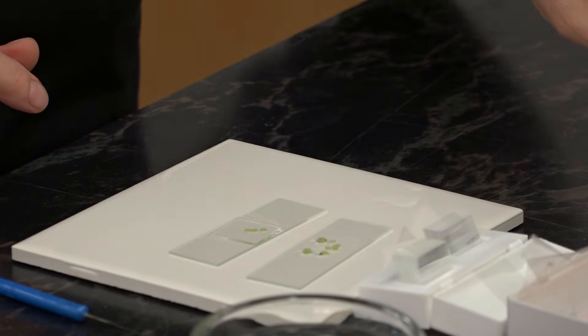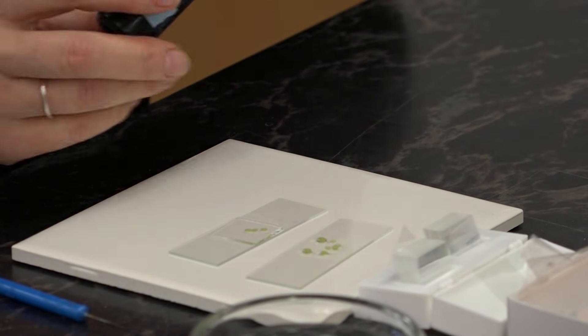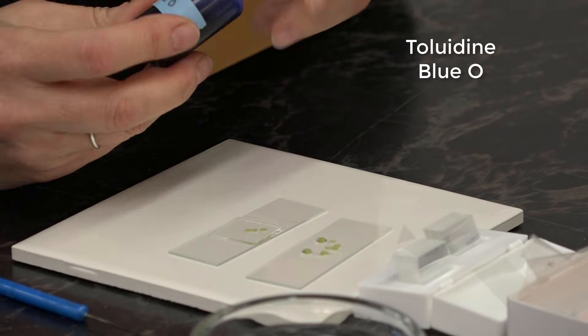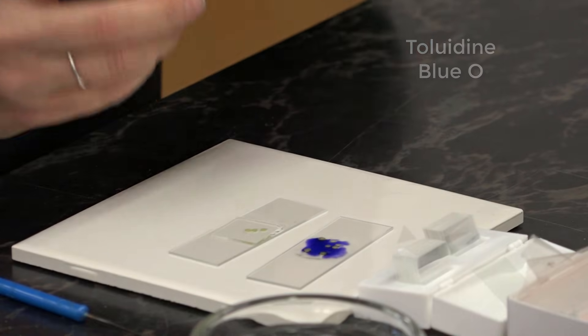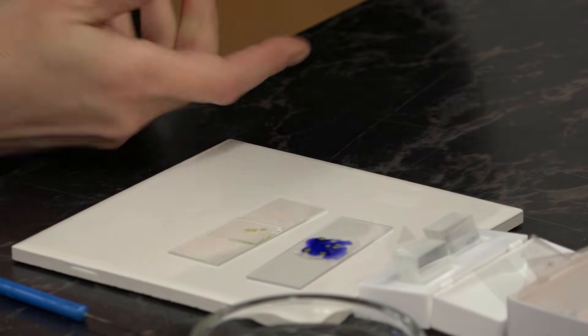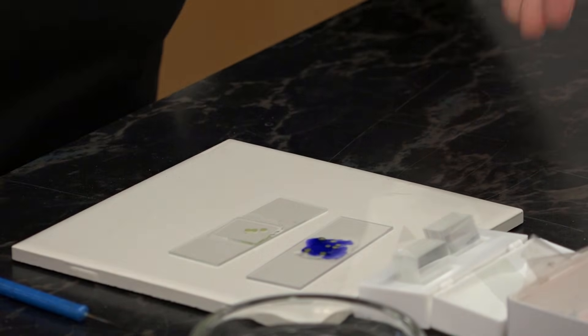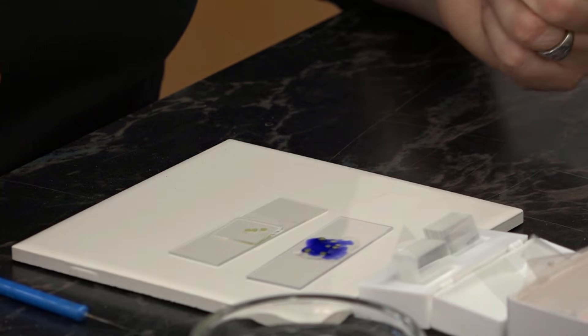For this example I'm going to stain it. I'm going to use TBO, and I'm going to add a drop or two of the stain, and let that diffuse into the tissues for a couple of minutes.